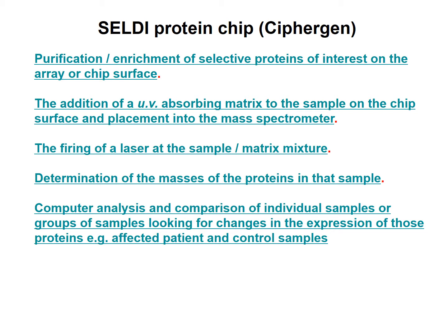So think about the affinity, things like charge, hydrophobic, hydrophilic, maybe some lectins or metal binding, those kinds of things. So think of all the different characteristics that we use for affinity chromatography of proteins. They've scaled it down onto a small postage stamp size chip, maybe bigger than that, but it's not too much bigger.